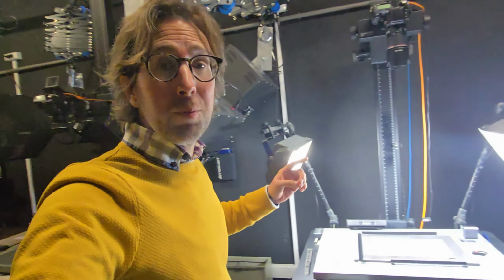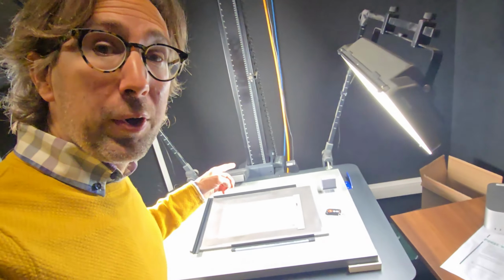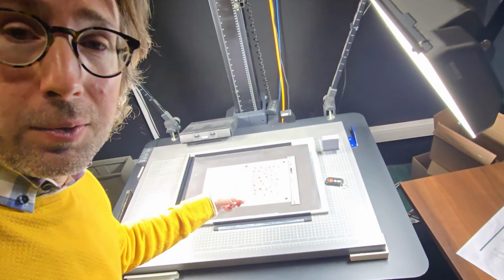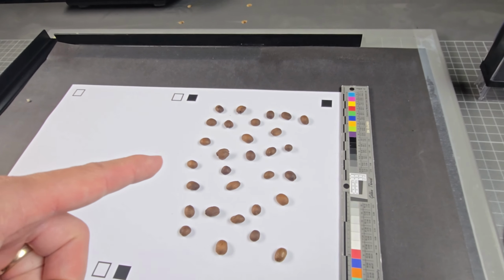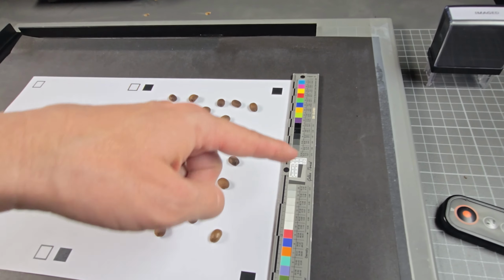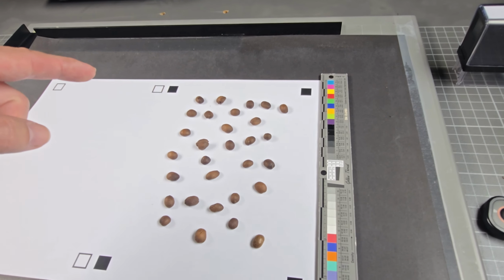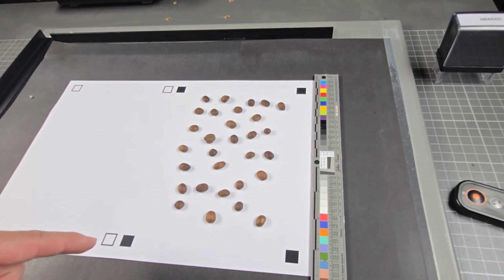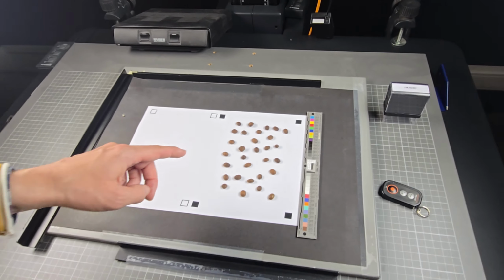So I found a small window of opportunity to look into another problem, and that is characterizing the color of these coffee beans. That's why we can use this kind of a color reference, but then also I have here in place these 1 squared centimeter squares as a size reference.